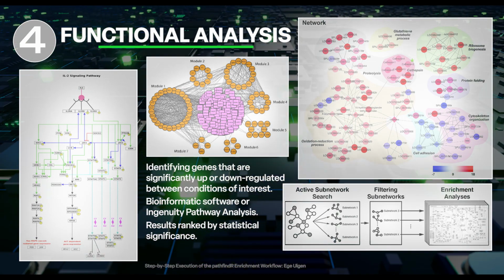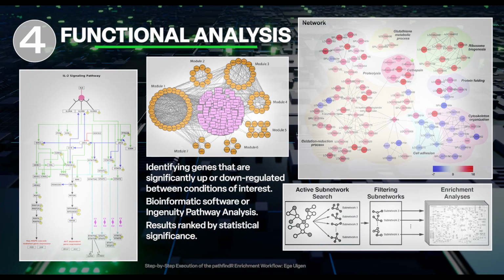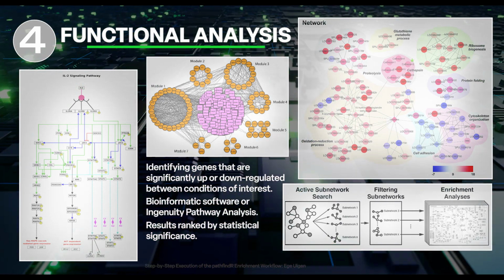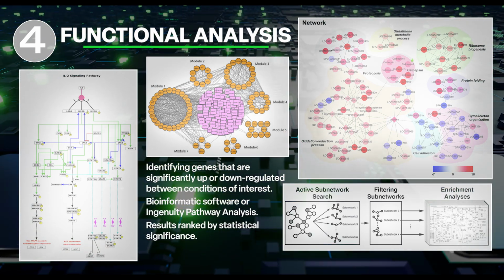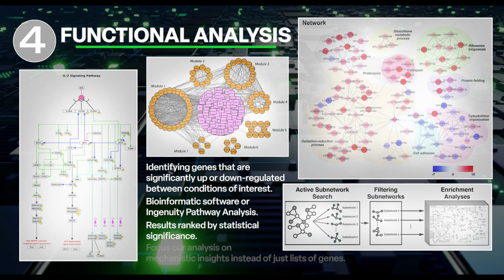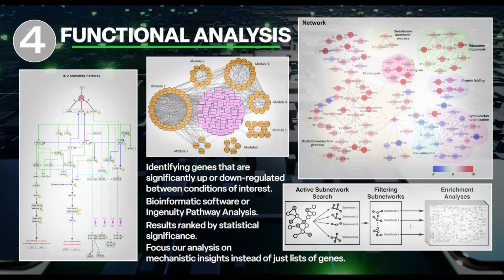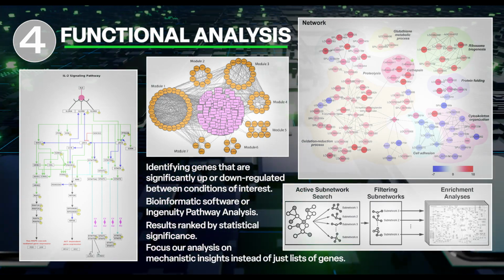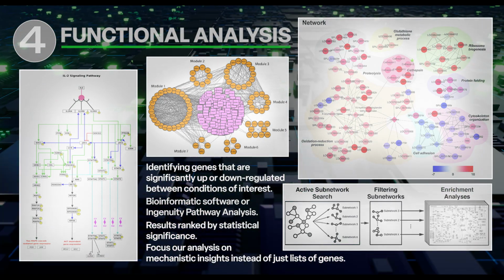By piecing together these enriched functions and pathways, we can start to understand the coordinated molecular systems that are altered in patients. Overall, integrating functional analysis with differential expression profiling focuses our analysis on mechanistic insights instead of just lists of genes.